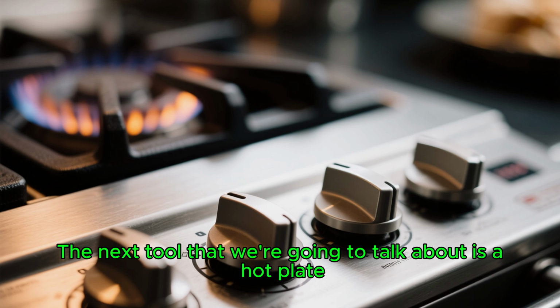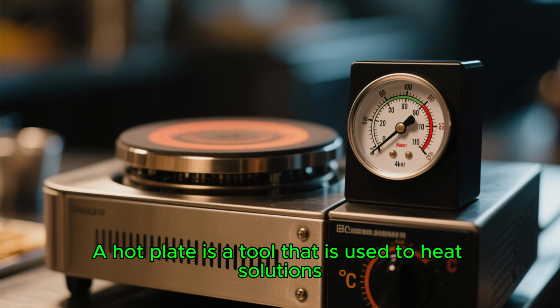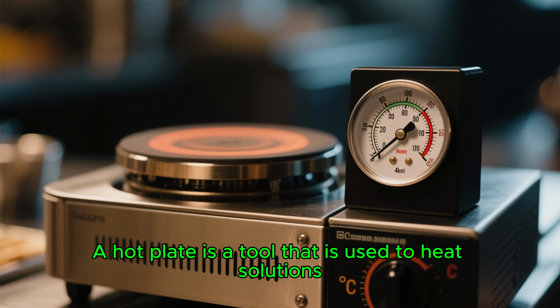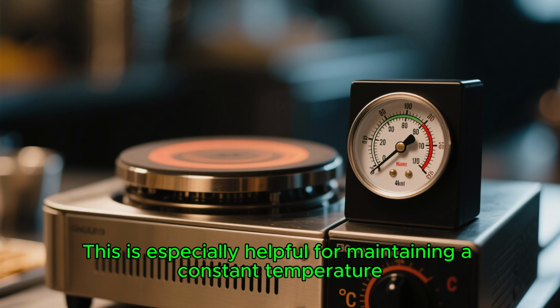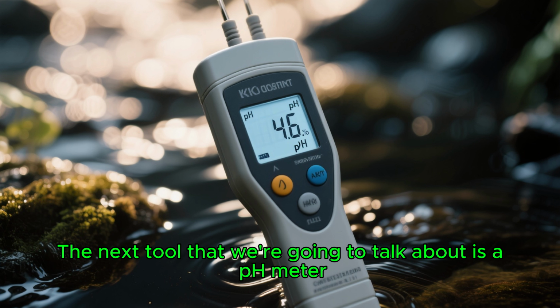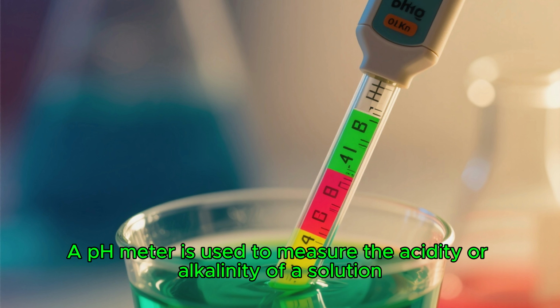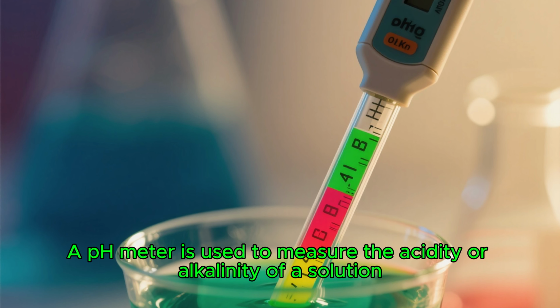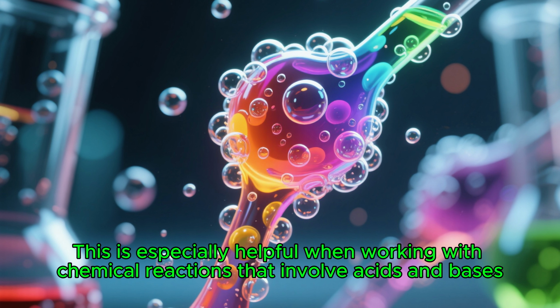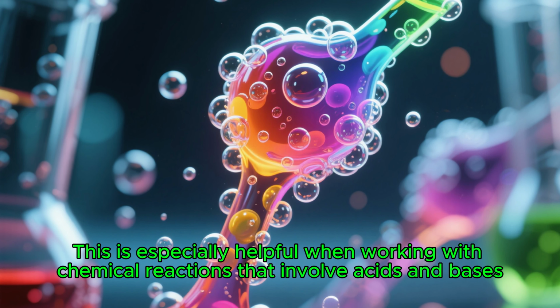The next tool that we're going to talk about is a hot plate. A hot plate is a tool that is used to heat solutions. This is especially helpful for maintaining a constant temperature. The next tool that we're going to talk about is a pH meter. A pH meter is used to measure the acidity or alkalinity of a solution. This is especially helpful when working with chemical reactions that involve acids and bases.